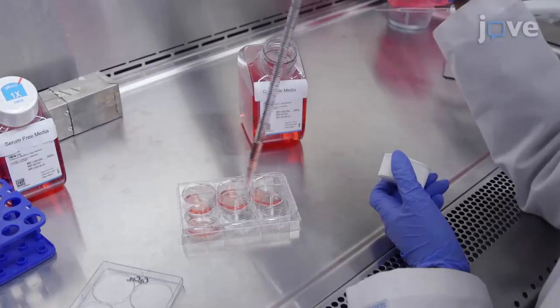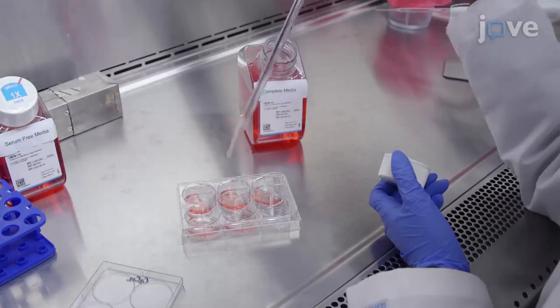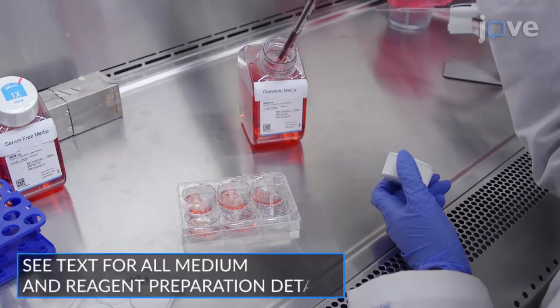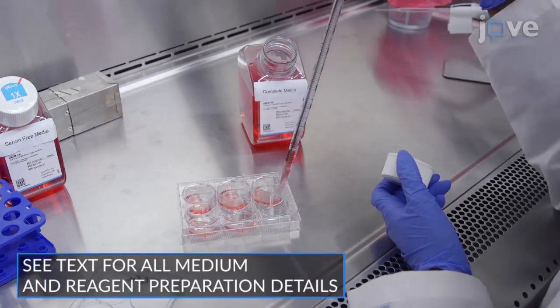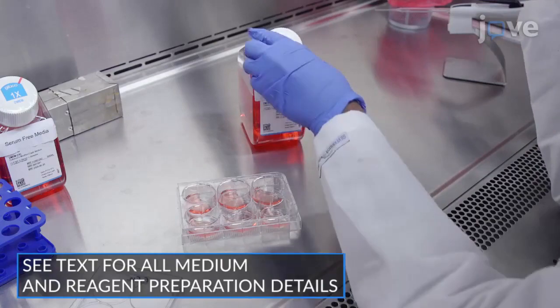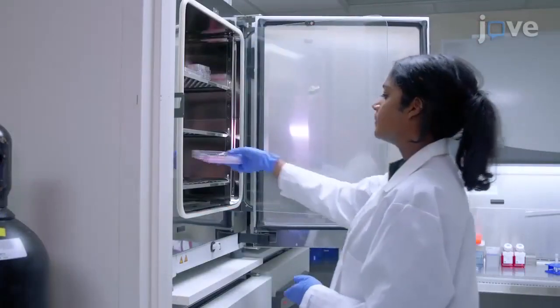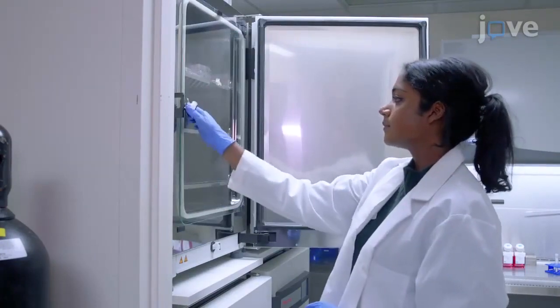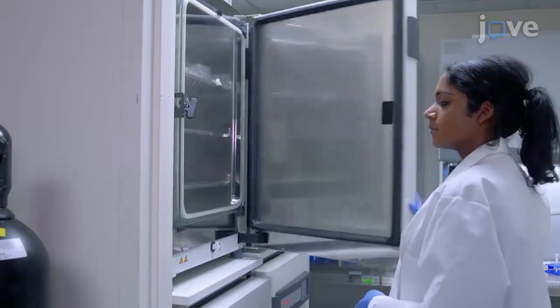The day before transfection, seed five times ten to the fourth C2C12 cells per milliliter in two milliliters of complete DMEM per well in a six-well plate, to achieve a 40–50% confluence after overnight incubation at 37 degrees Celsius and 5% CO2.